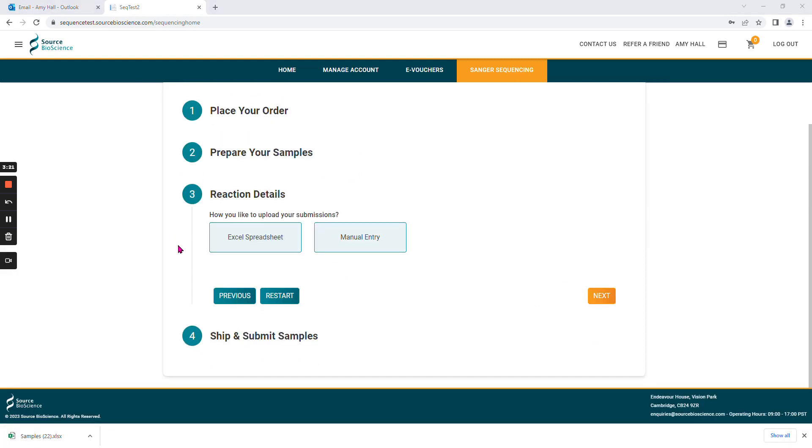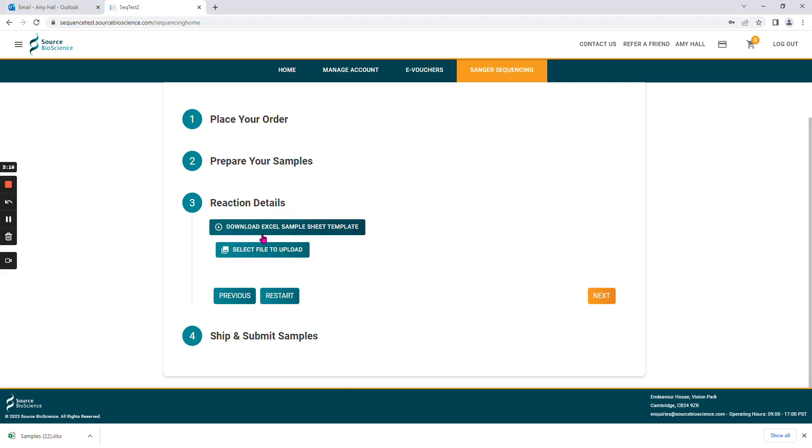You can upload your samples by Excel spreadsheet or by manual entry. If you choose to use the sample sheet template, please ensure you download a new template every time you've added new synthesized primers to your account, as this will update the list of primers that are available to you.